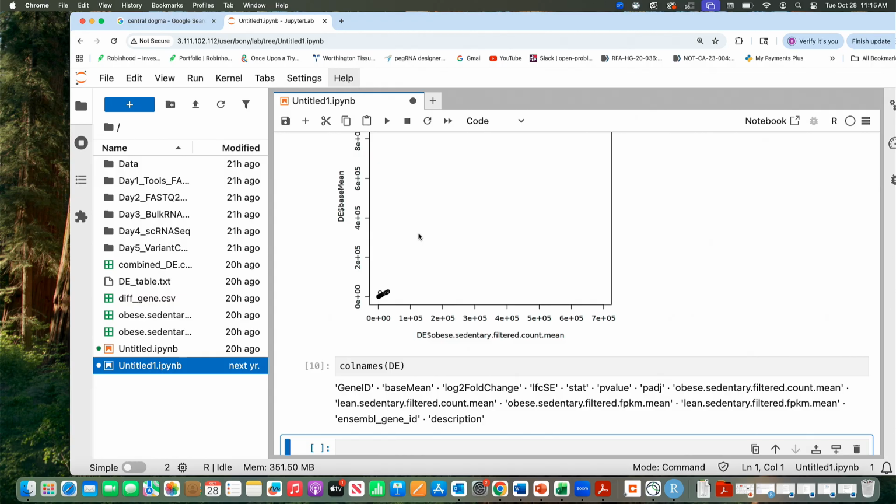You have 2 minutes to do so. No, just use this colnames. So you have done already. So basically you can use colnames to find which are the columns, and then, fine. Make a couple of them, so you learn how to actually pick a column and then use plotting. Okay, everybody is fine, everybody is comfortable.